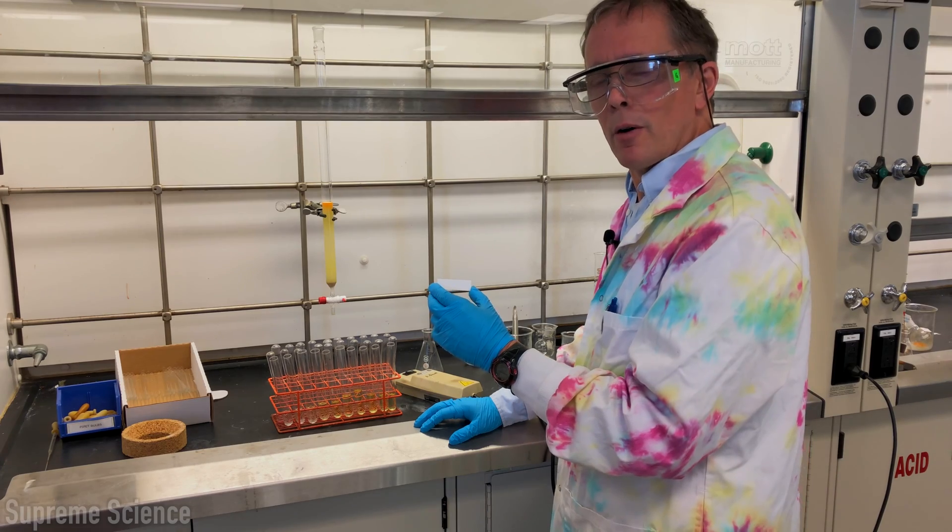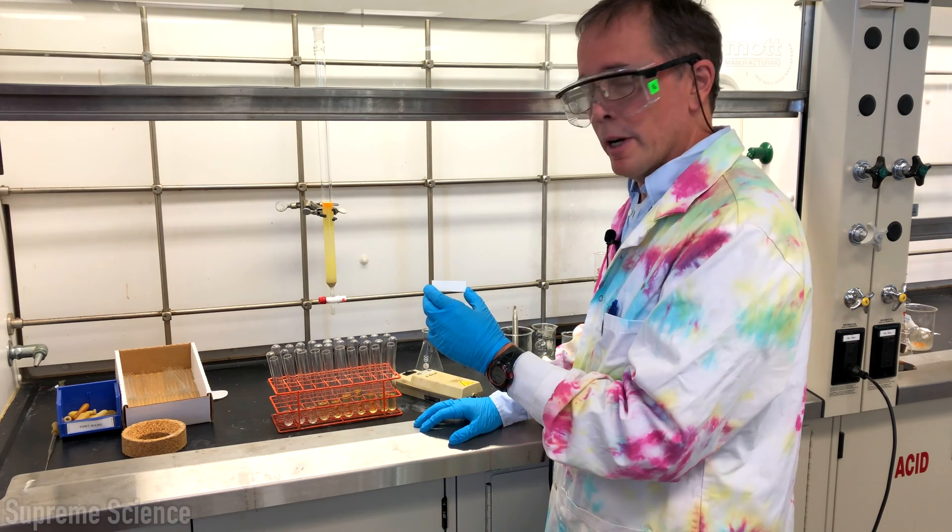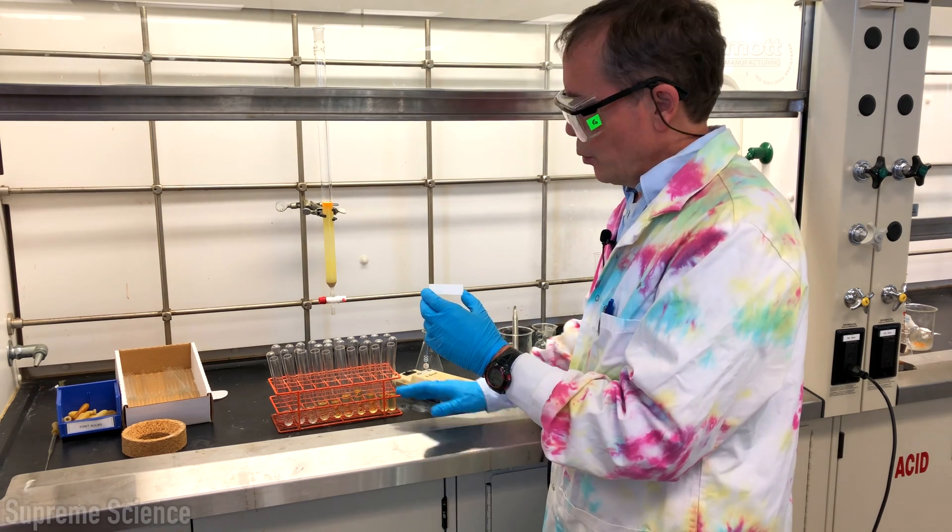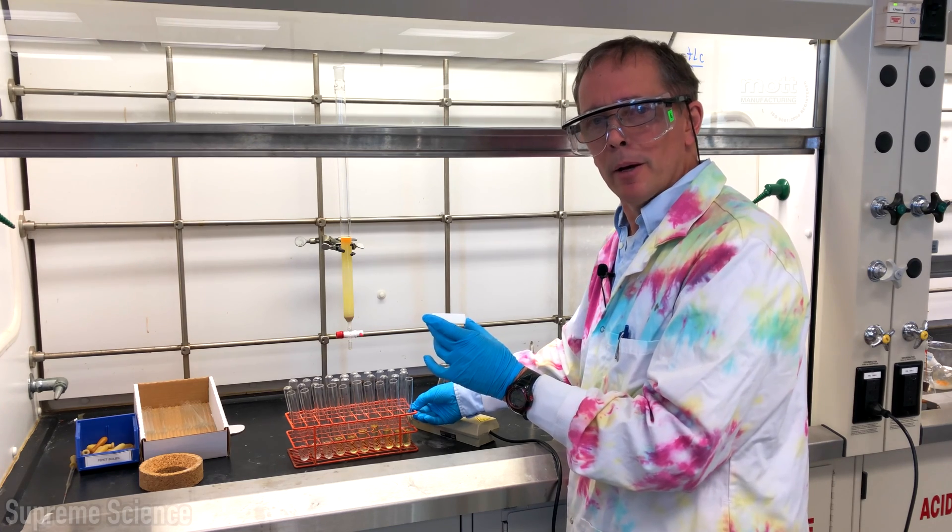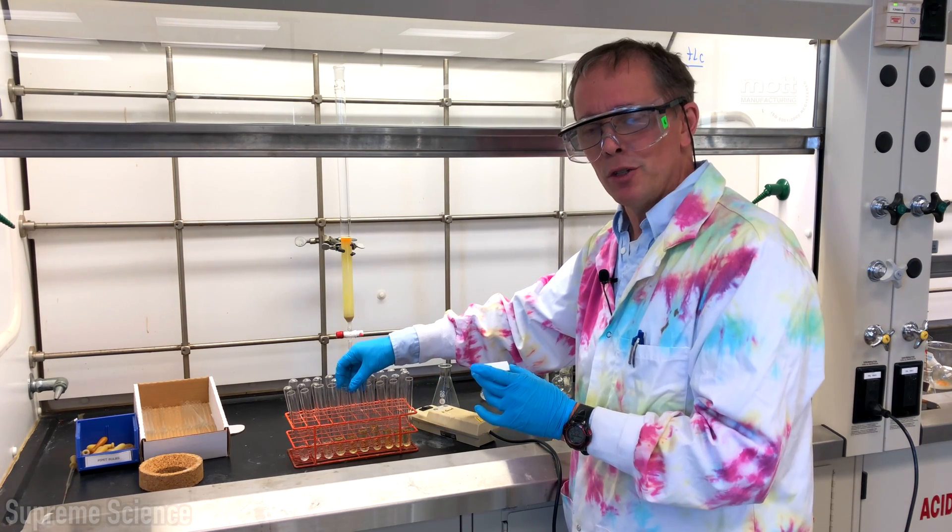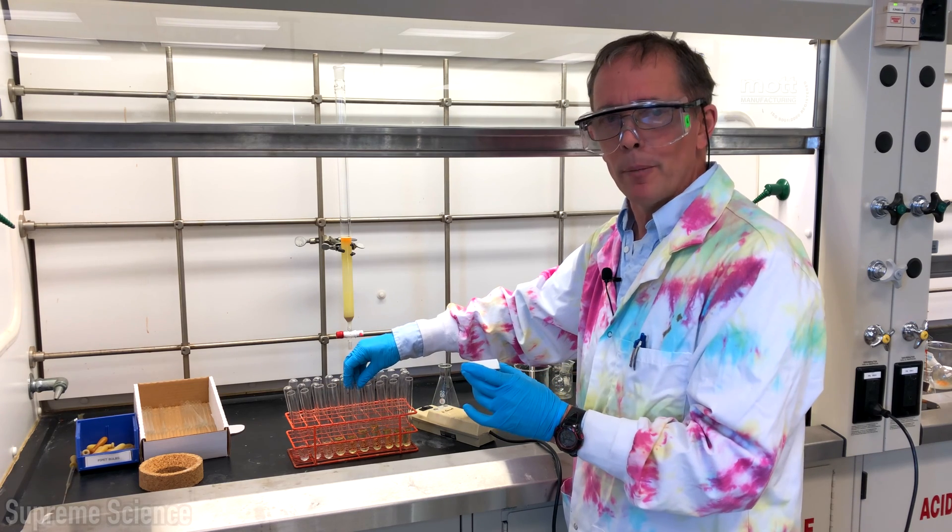Now that we have our high and low spots, we can continue to survey the rest of the fractions to know which tubes we should combine to isolate our desired compounds. We'll combine fractions, put them into a round bottom flask, rotovap them, take an NMR to confirm that we have indeed isolated the pure compound.